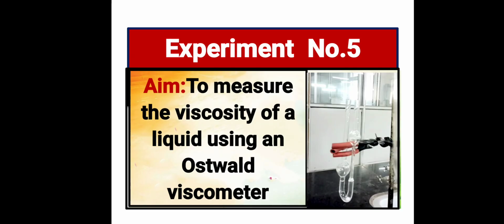The aim of our practical is to measure the viscosity of a liquid using an Ostwald viscometer. In this practical, we learn what viscometers are, the different types of viscometers, and also the procedure to determine the viscosity of a liquid.